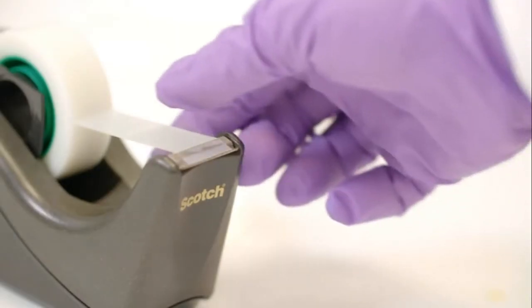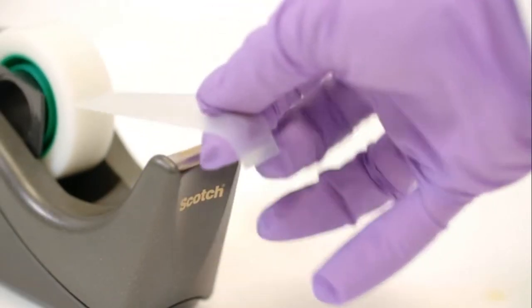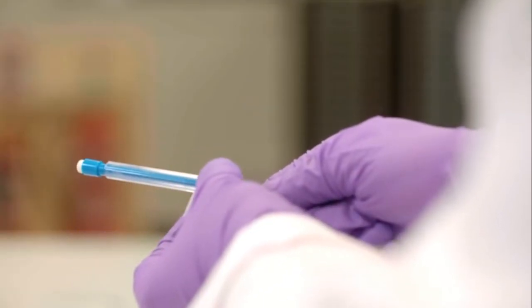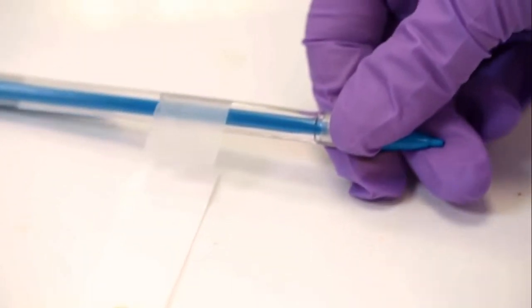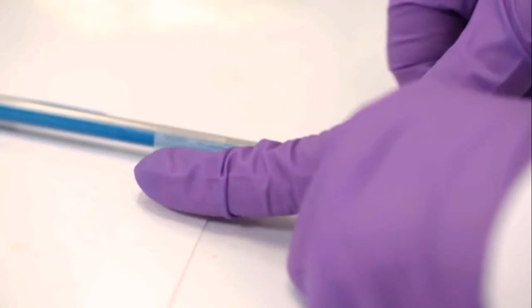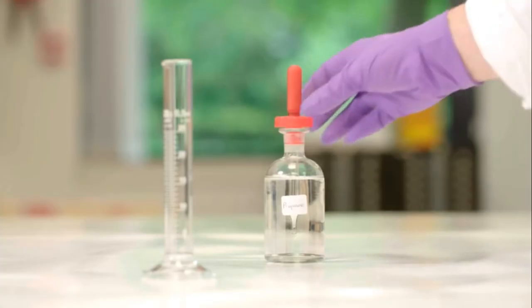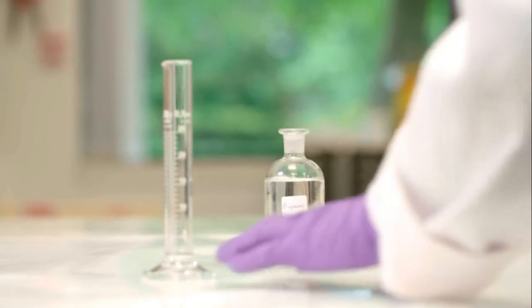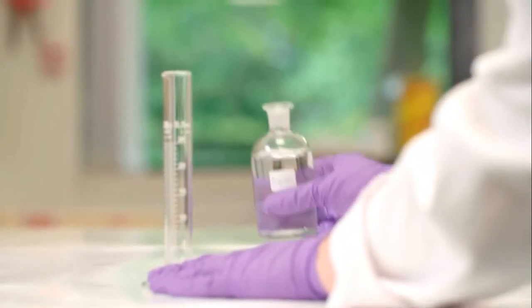Now the paper is attached to a pencil using sticky tape. 20cm³ of propanone is measured out using a measuring cylinder and poured into a large beaker.